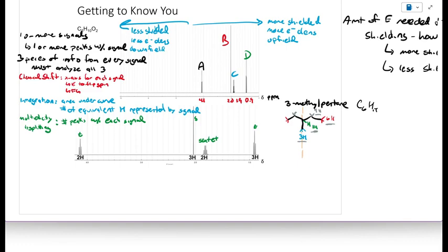And so you'll have at least one, a singlet, but you could have 2 peaks within the signal, a doublet, or a triplet. 4 peaks within the signal would be a quartet, and then a pentet, a sextet, a septet, an octet. It doesn't really matter how many peaks you have within the signal. That's what the multiplicity is. It tells us the number of peaks within the signal. And what this tells us is the number of hydrogens on the neighboring carbon.